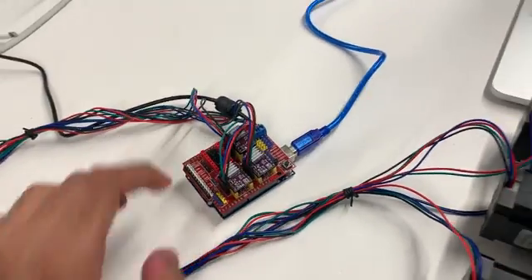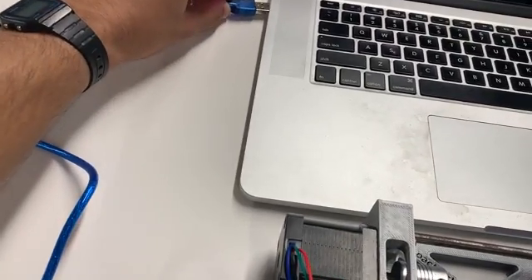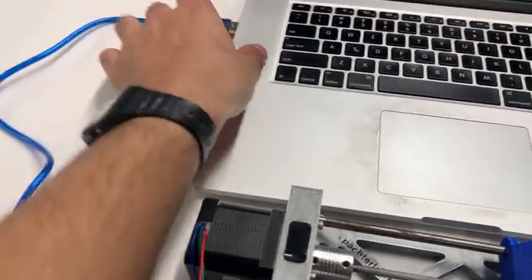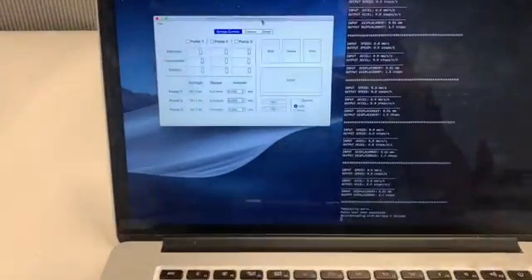Once we decide what microstepping we're going to use, we'll go ahead and plug our Arduino into our computer via the USB port. Everything sounds good — everything's activated. And now we'll walk you through the GUI.